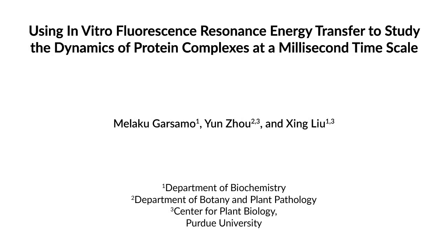Our method helps study the kinetics of a protein complex formation. It describes how tight a protein complex is and if the protein complex formation is interfered by other proteins. This technique enables studying protein-protein interaction in a quantitative way. Using fluorescence as a reporter, our assay can monitor the association and dissociation of a protein complex in real time.